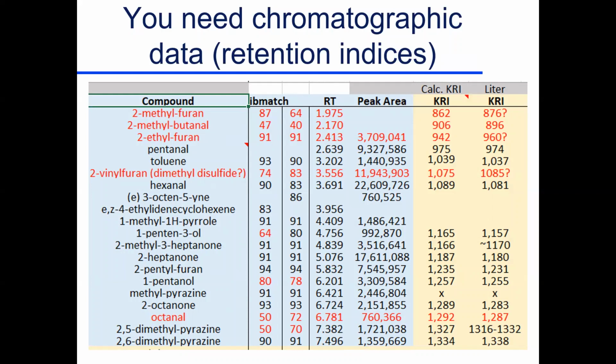This is a low resolution instrument. Mass 94, for example, can come from different combinations. It looks like the right match, could be the right match, but it's not good enough to say it is what it is. And if you're going to publish this, you're going to be darn certain that it is what you say. Sometimes, no matter what you do, you don't know. You can list it as tentative, right? But you differentiate what you know and what you don't.